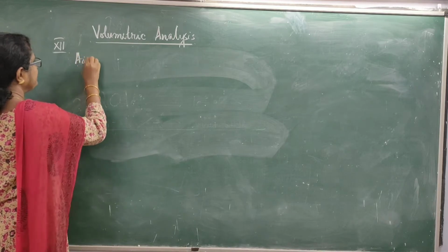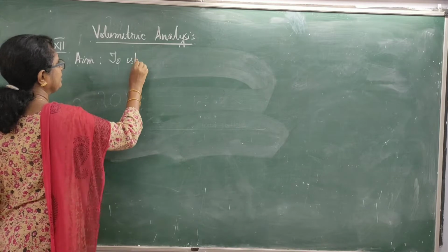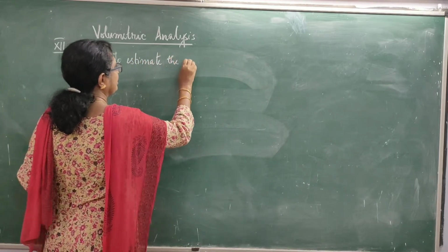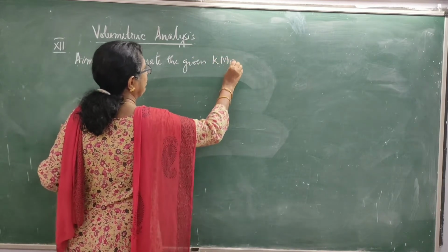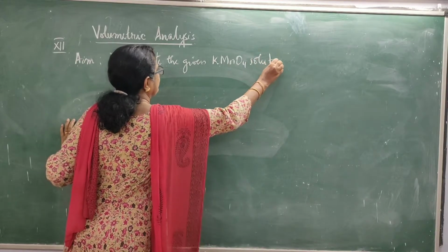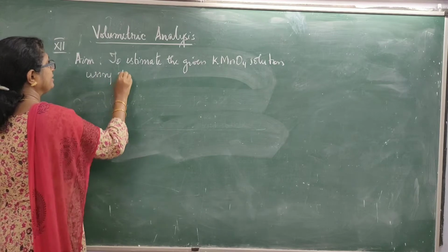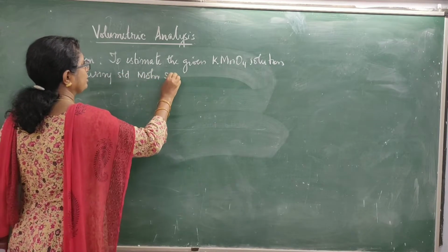Aim: to estimate the given KMnO4 solution using standard Mohr's salt solution.